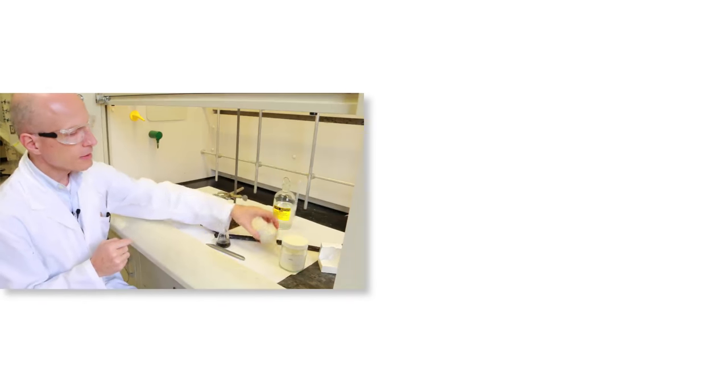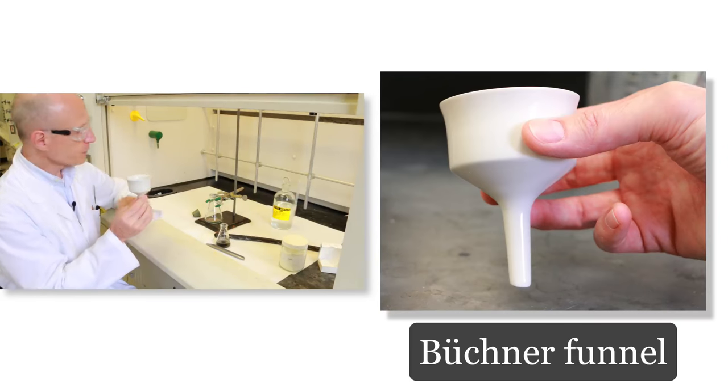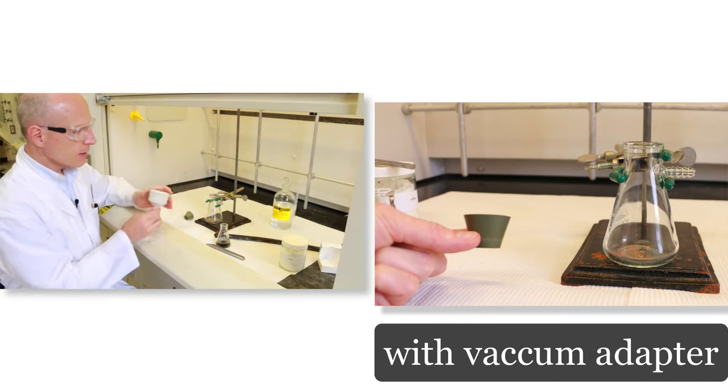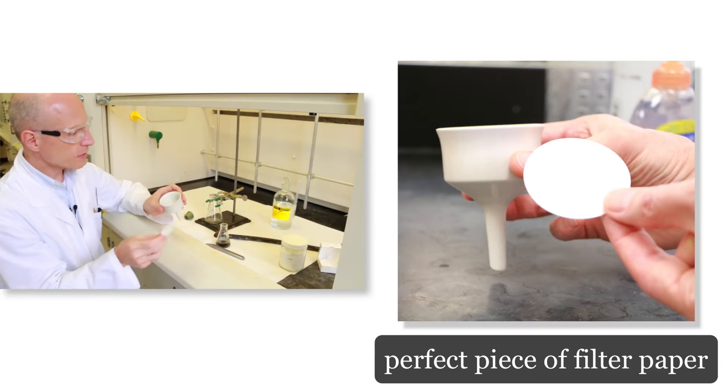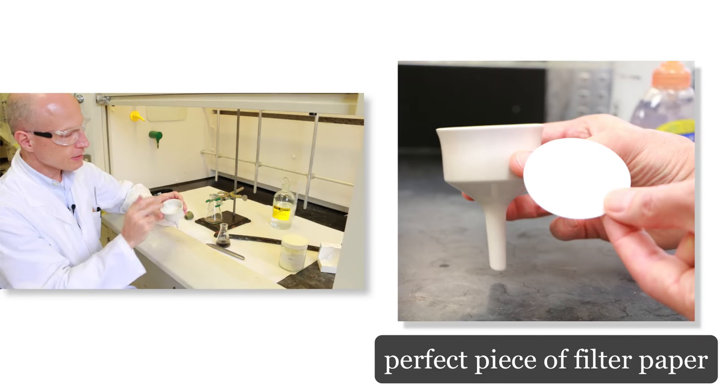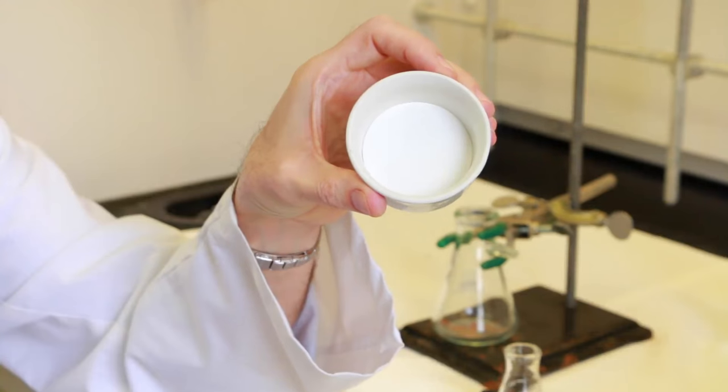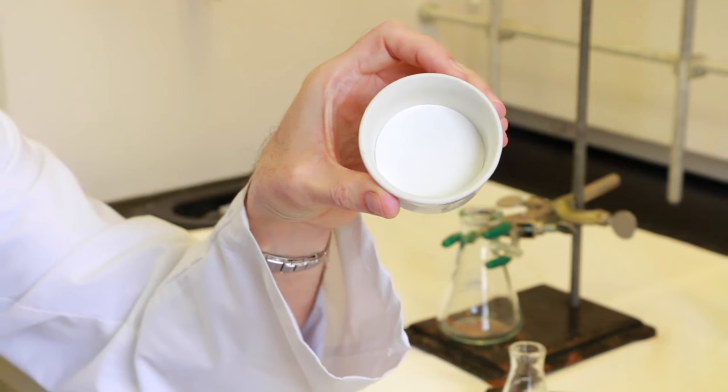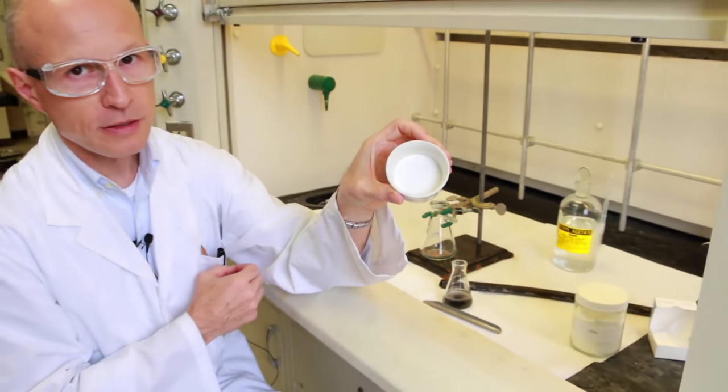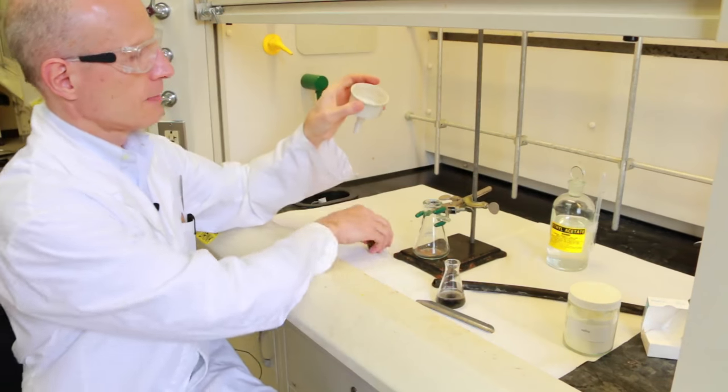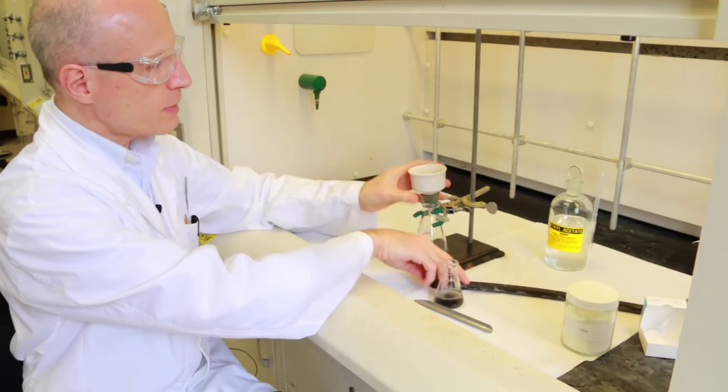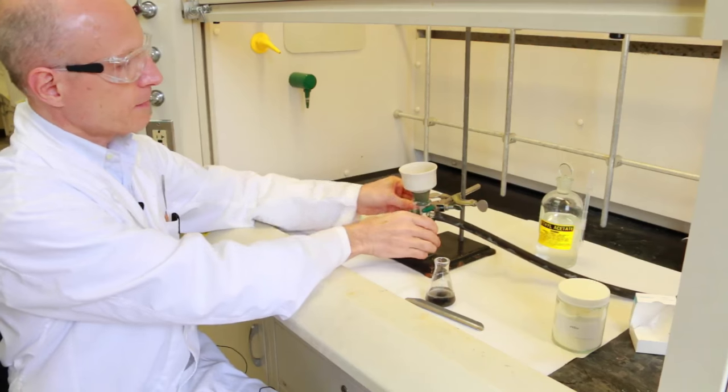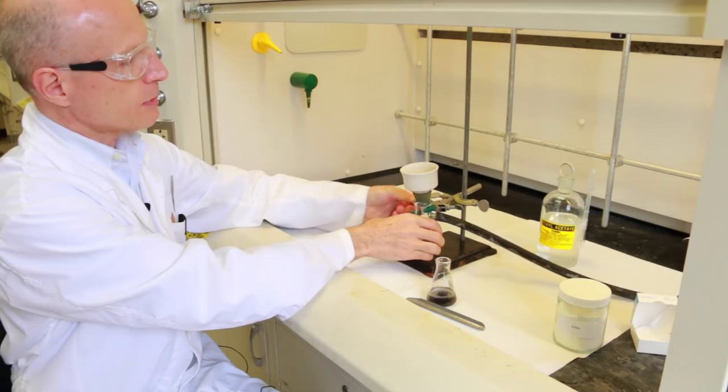You will need a Buchner funnel, a clean filtering flask with a vacuum adapter, and a piece of filter paper that fits perfectly inside your Buchner funnel. It cannot be too small or too big that it climbs on the walls of the funnel. Then you set up your filtering apparatus and clamp the filtering flask.